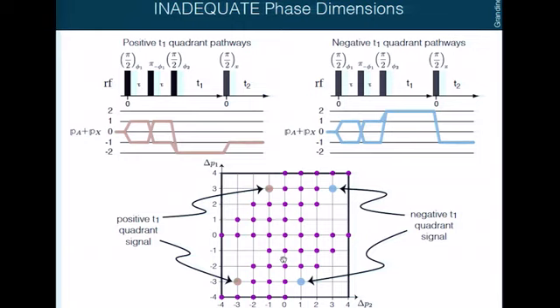And the thing about phase cycling, since I'm almost out of time, is that you throw all that information away when you phase cycle. If you keep the phase dimensions, you know when something's going wrong where that signal went. How many times have you stood in front of the spectrometer and watched your signal grow, grow, grow, and then die, die, die, grow, grow, die, die, and then it's gone? Like, where did it go? Well, if you had a phase dimension, you'd see where it went, okay?